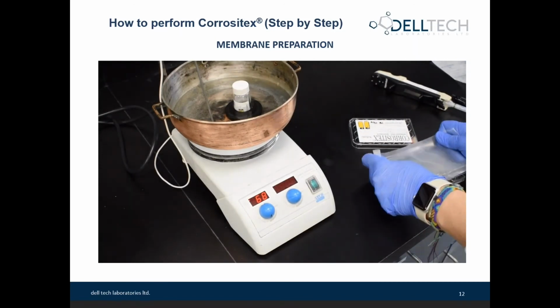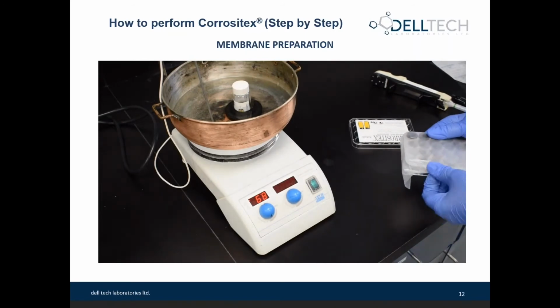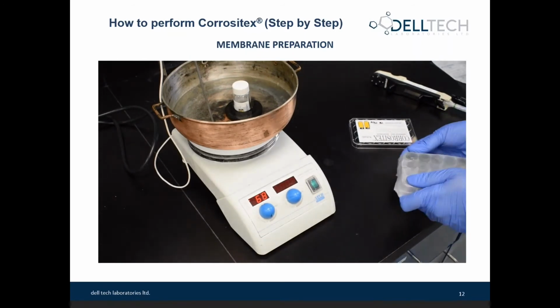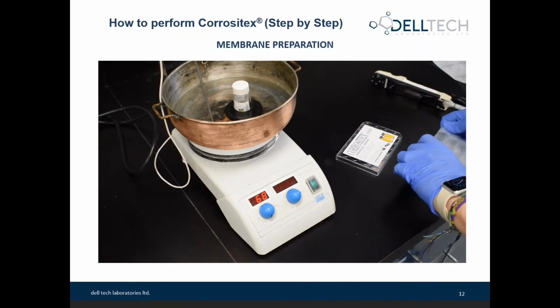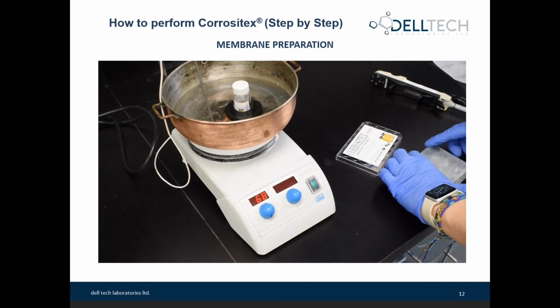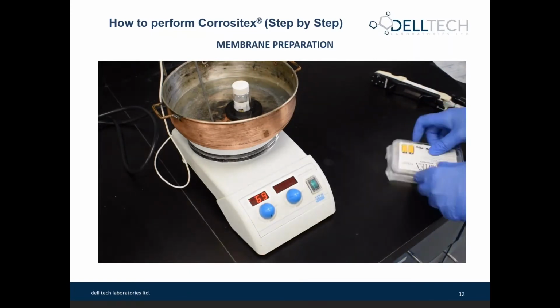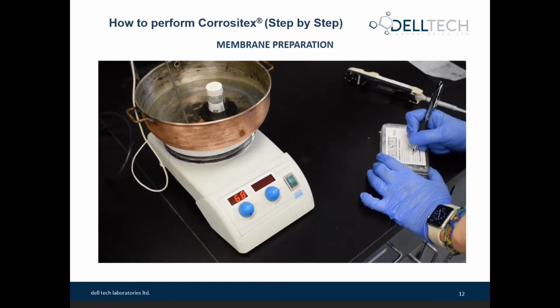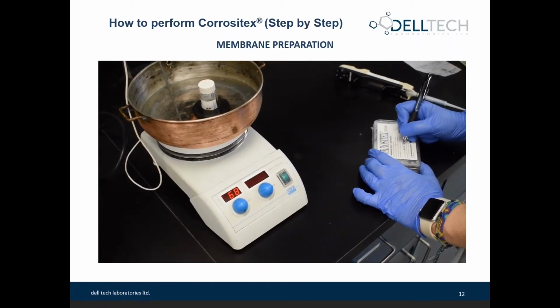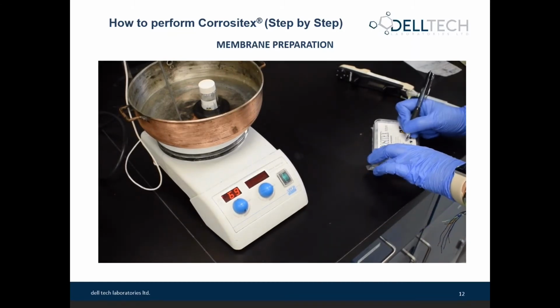When you're done pipetting the BioBarrier in, you want to take your tray and tightly wrap it with saran wrap or the parafilm. And you could store it for 2 to 8 degrees Celsius for 7 days. Be sure, when we put the cover back on, that you'll write down the preparation time because you need these to refrigerate for at least 2 hours before using. Typically, we make the barriers one day and then we use them the next day.